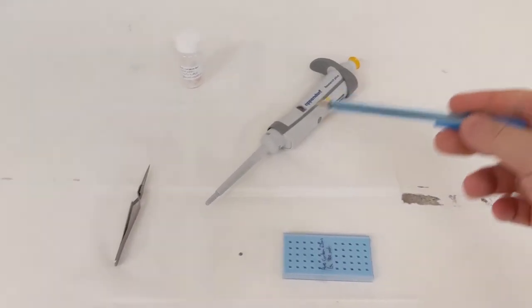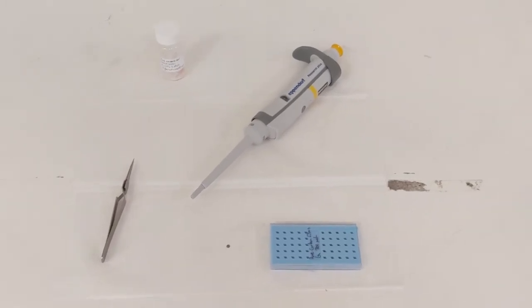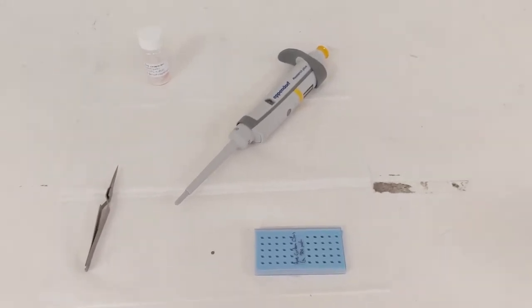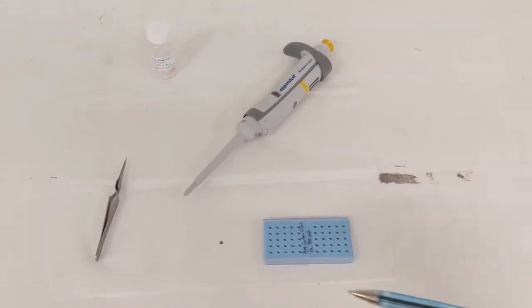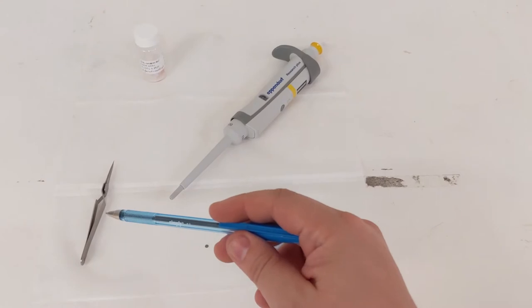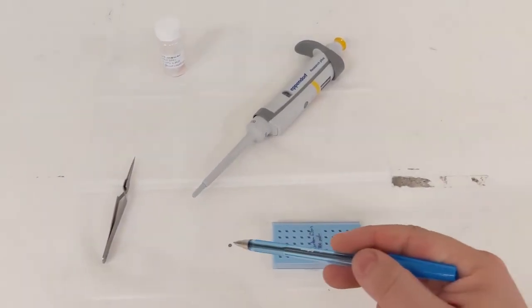We will also need a pipette to measure out a small quantity of solution, roughly 20 microliters, and we're going to use that to drop that onto the grid, and while we do that we will hold the grid using our self-closing tweezers. For a size comparison, this is that grid.